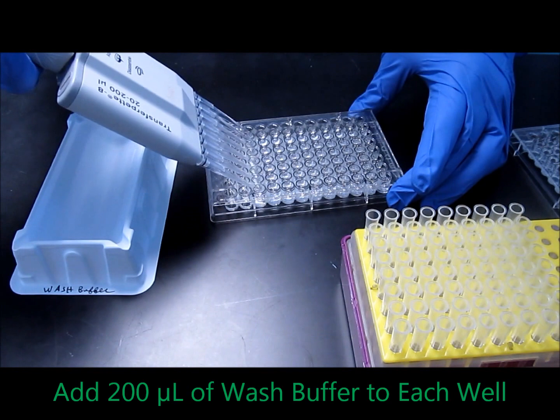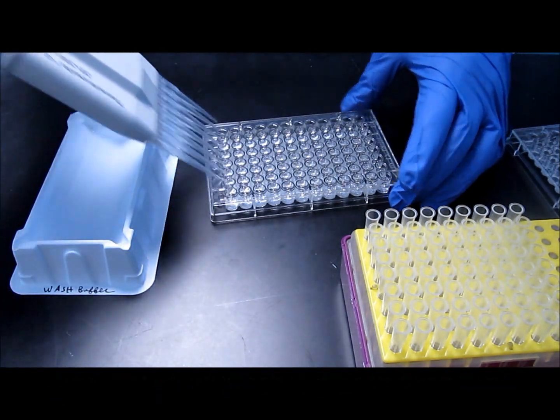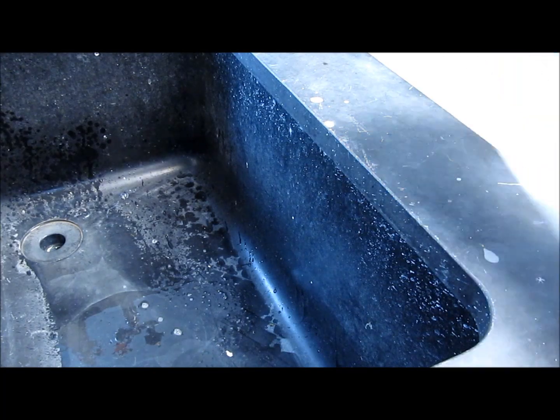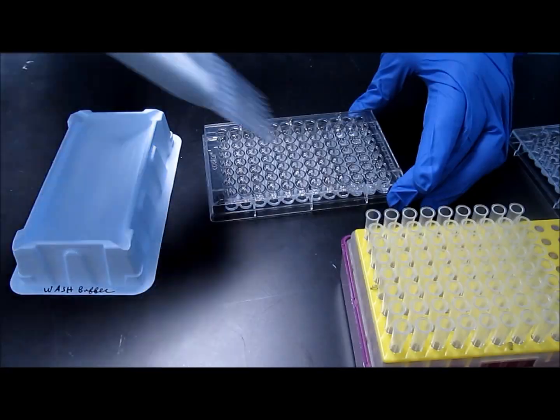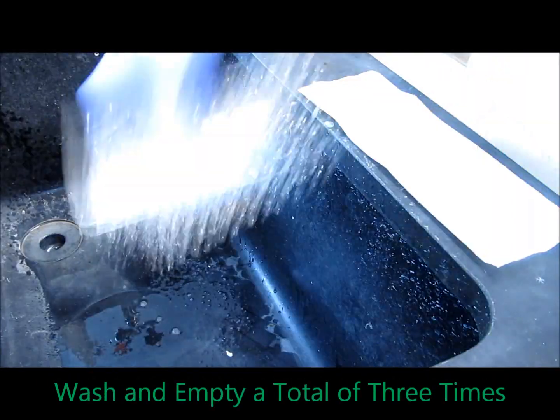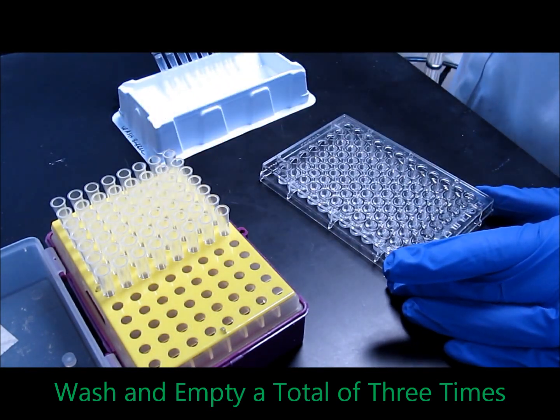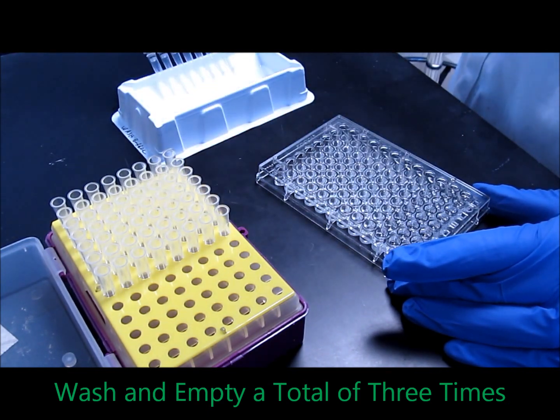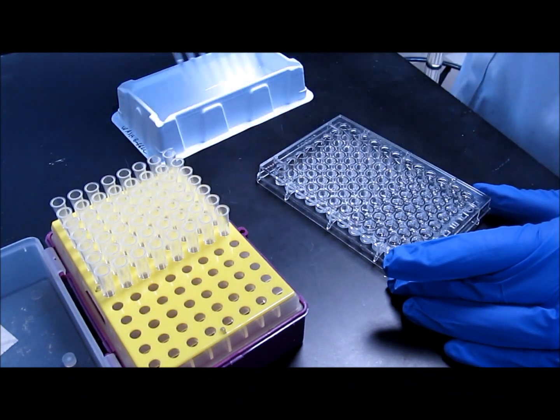200 microliters should be more than sufficient to fill up the plate. Once you're done pipetting, give the plate a gentle tap to make sure everything's mixed. Then repeat the emptying step, and repeat filling and emptying. You're going to do this a total of three times to make sure you've removed any residual capture antibody from the well. This process of washing and emptying is going to be repeated throughout the ELISA process.